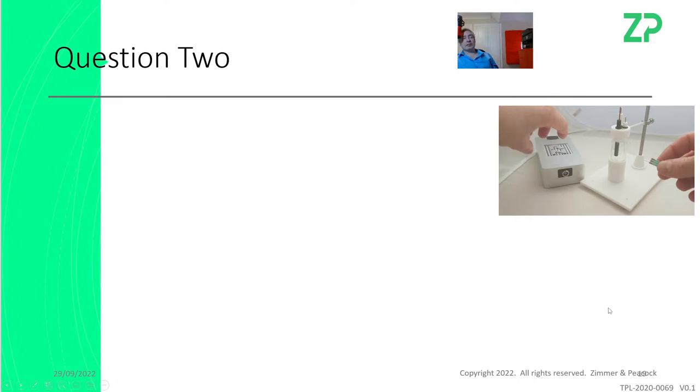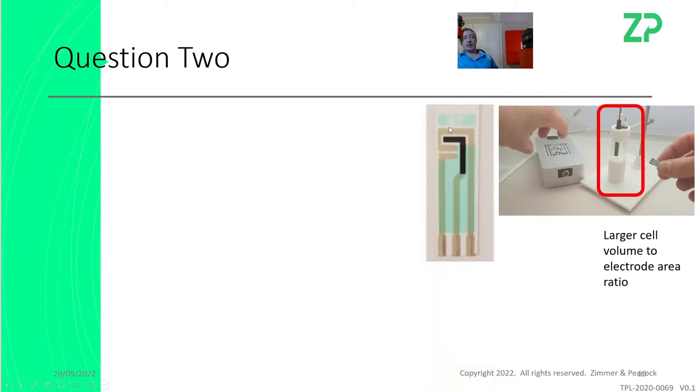Lots of our assumptions about the relative size of counter electrodes come from doing more traditional cell electrochemistry like this, where you've got a beaker in which the electrodes are sitting. So some of the assumptions that are taught or in textbooks are because people are thinking about cells like this. In electrochemical biosensing, you can have a sensor like this with a volume here, which can be 50 microliters or less. And that means this, and I should emphasize the word here.